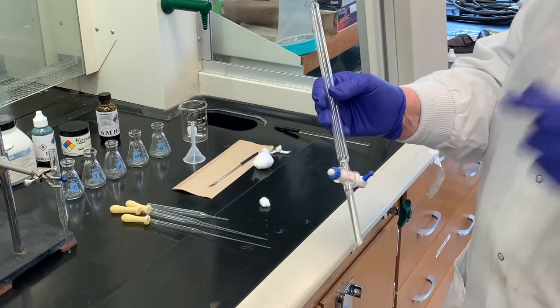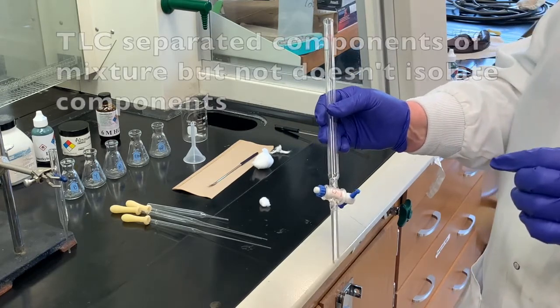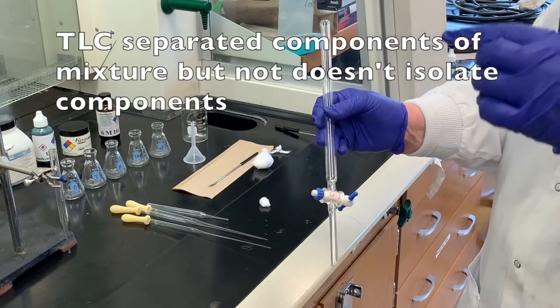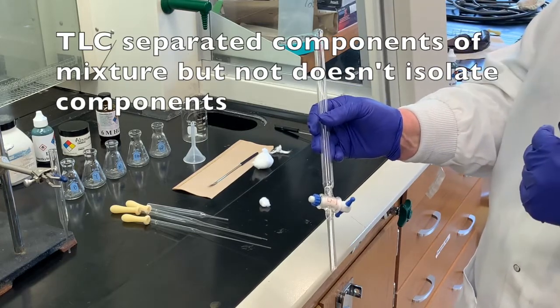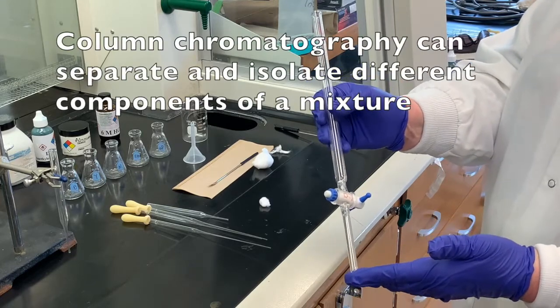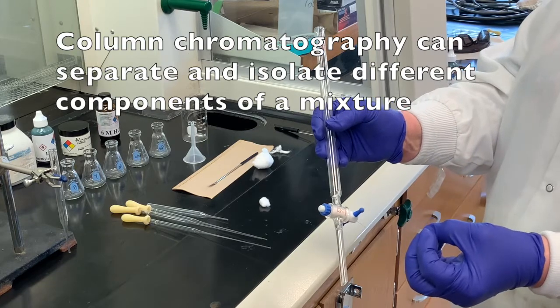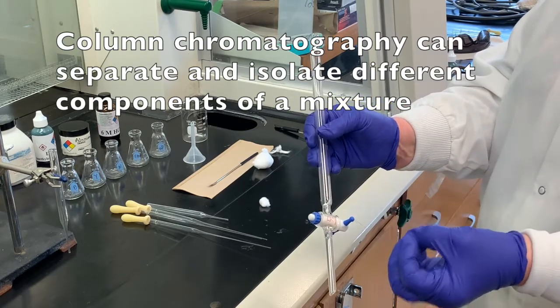And if we took that, we couldn't actually isolate any of the material. We could see the different components there, but we didn't really isolate anything. By using column chromatography, this allows us to actually collect the samples that we're trying to separate within that mixture.